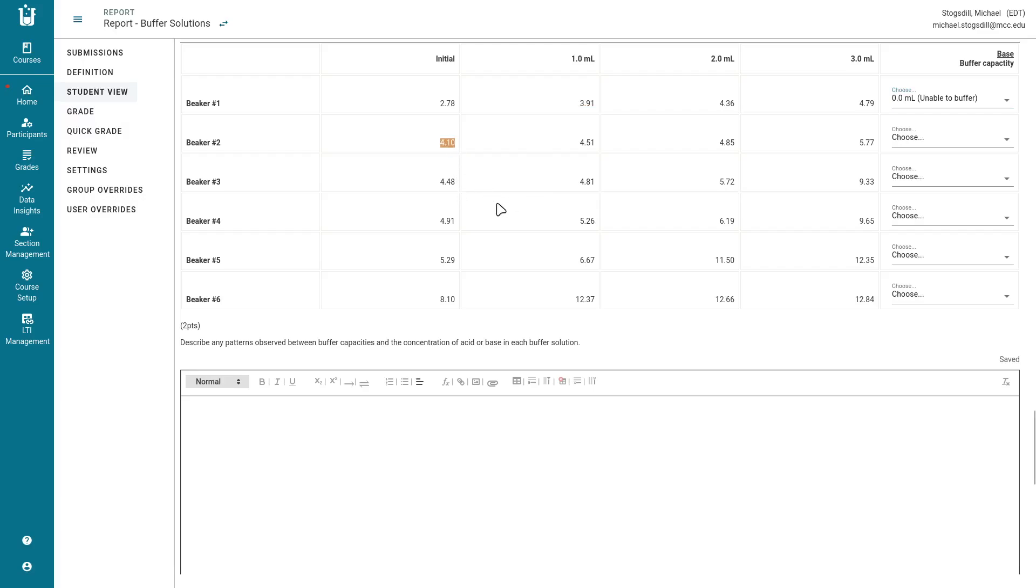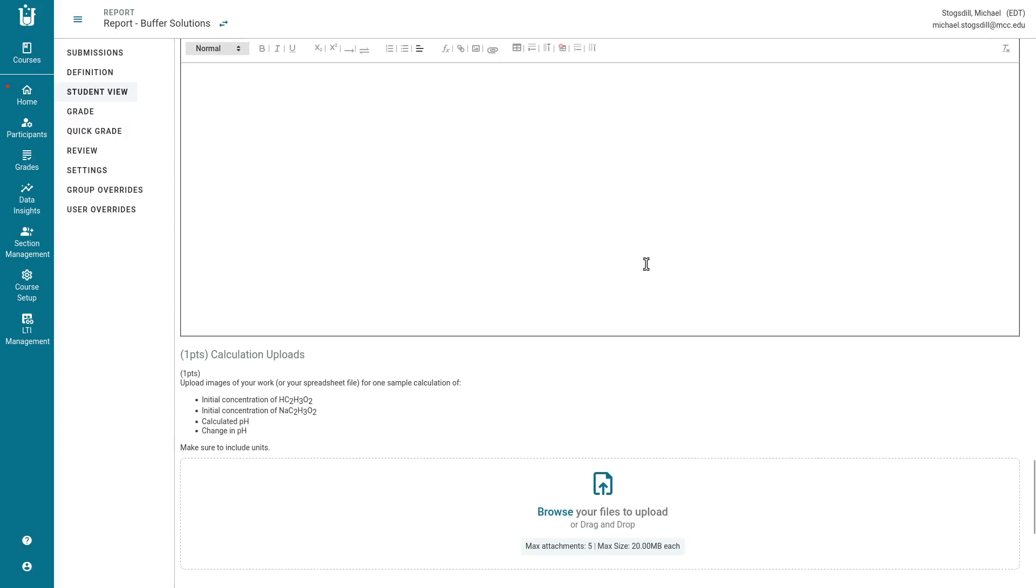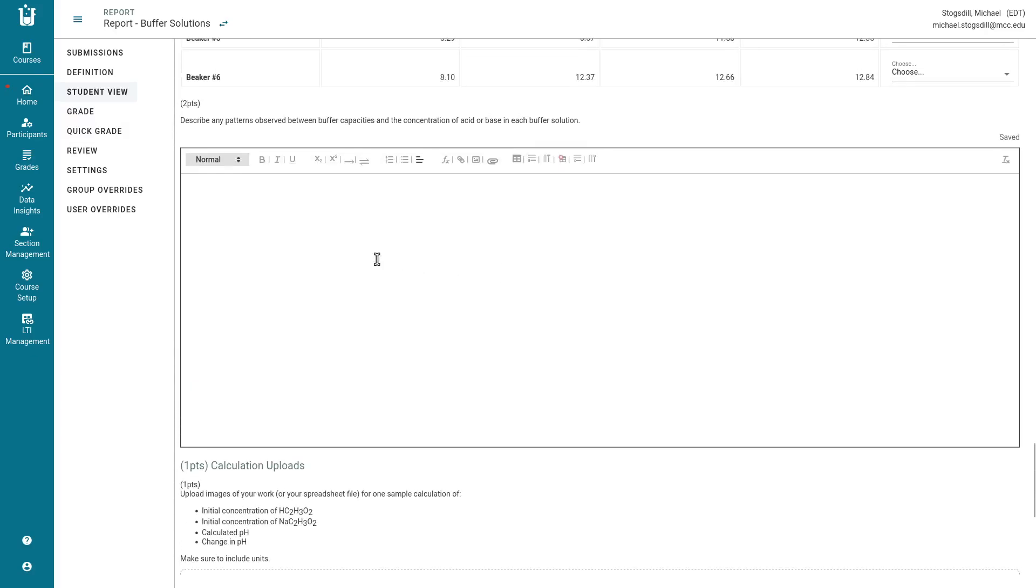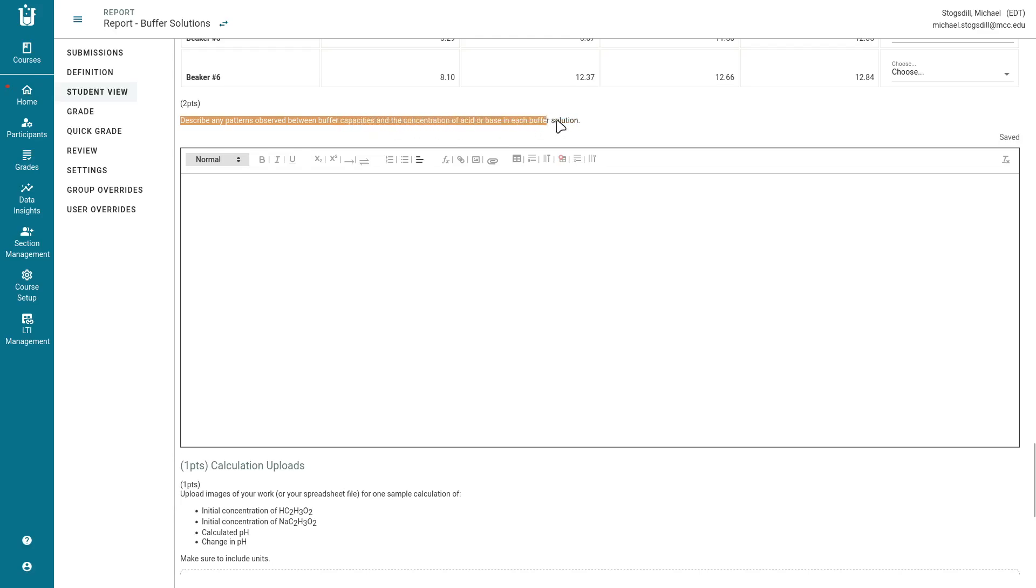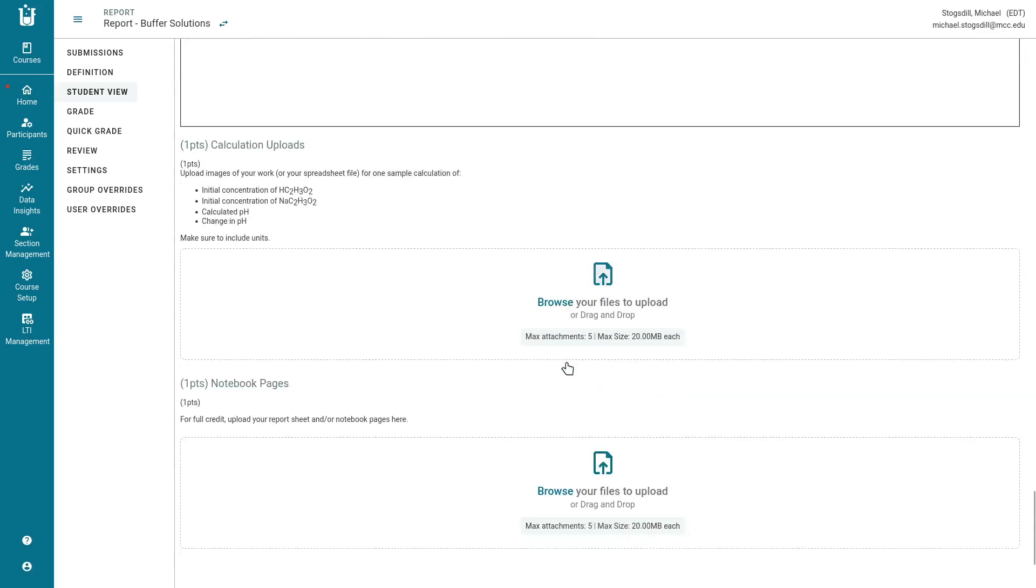In this case, it has to keep it below 5.1. At 1 mil, it has done that. At 2 mils, it has done that. At 3 mils, it has failed. So the buffering capacities for this is going to be 2 milliliters of base. After that, we're going to see if we can describe any patterns observed between the buffering capacities and the concentration of the acid or base in each of the buffer solutions. See if there's any conclusions you can draw from that. And then you'll upload your work and your notebook pages.